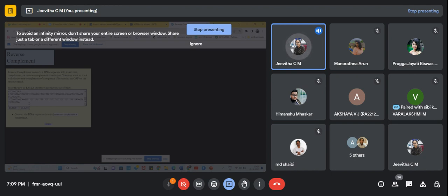When handling bioinformatics software or data, everything you give is very important: capital letters, small letters, dots, everything matters. Further on we'll also learn Linux and Ubuntu, and there too you can see how important capital or small letters are, and even a single dot can stop you from getting the output. All those things matter when you're handling bioinformatics data.